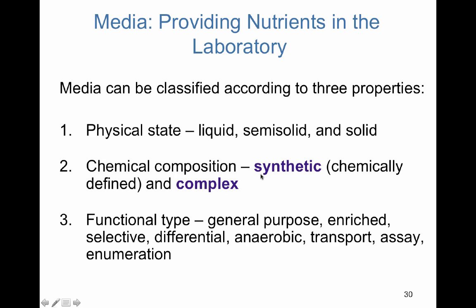So there's synthetic versus complex. So synthetic has the advantage of it being chemically defined. So we know exactly what is in the mix, whereas complex has this different mix of extracts from various cell types, or meat from peptone, or mixes of different protein or amino acid recipes that we don't know exactly what is in there.